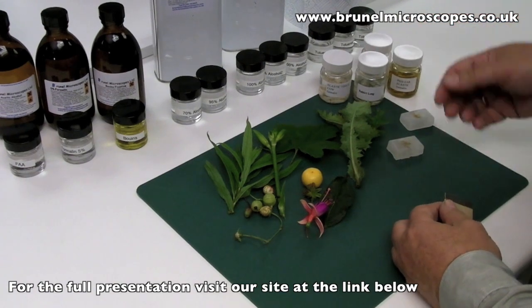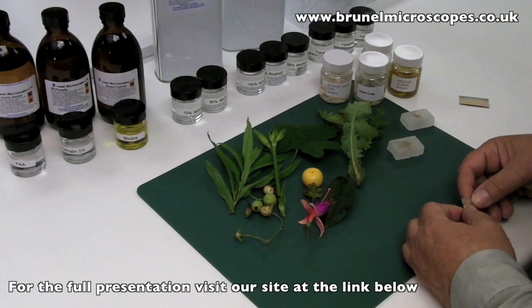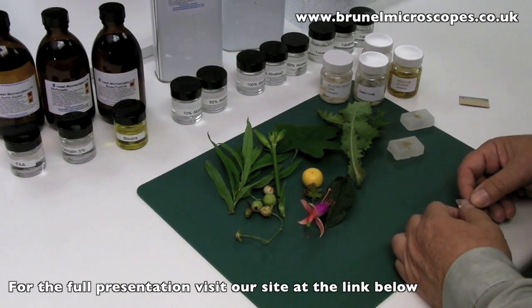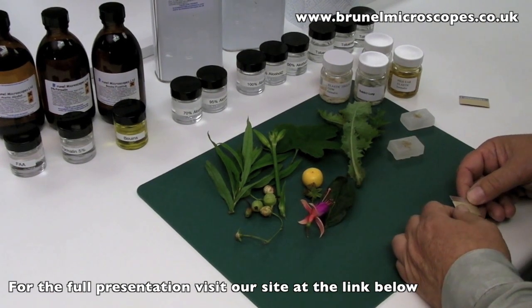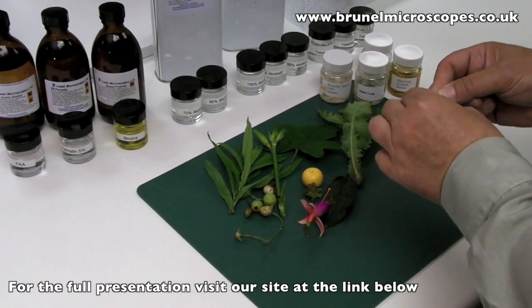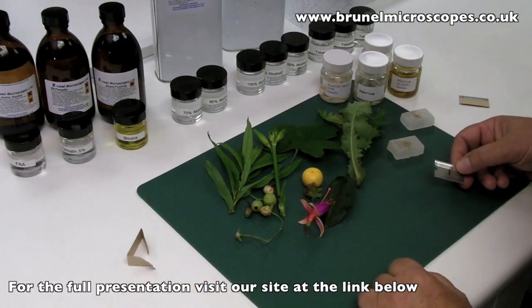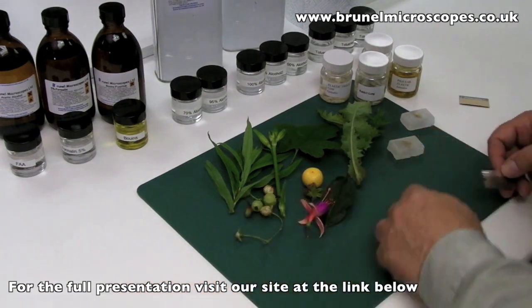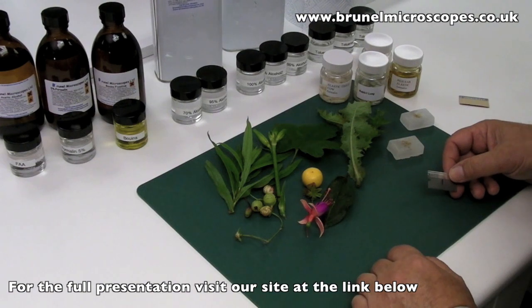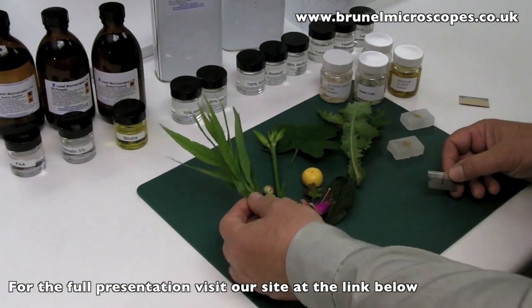Here we have a variety of botanical specimens and some previously fixed animal tissues. Select pieces with a sharp knife or a safety razor blade, which is particularly ideal for this purpose. Think ahead to how the material will look in a wax block and how you can select pieces from the specimen that will represent the structures you want to see in your stained sections.